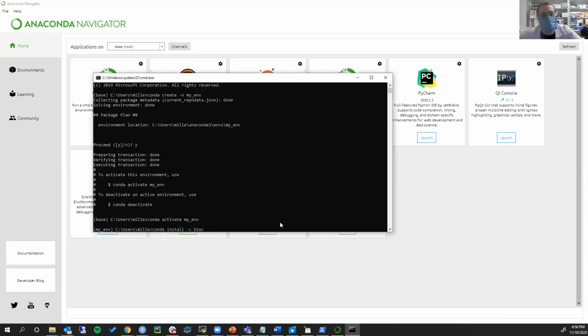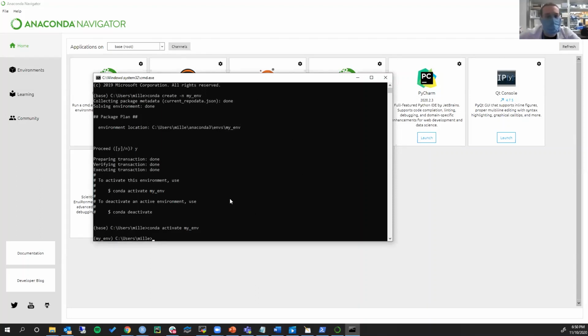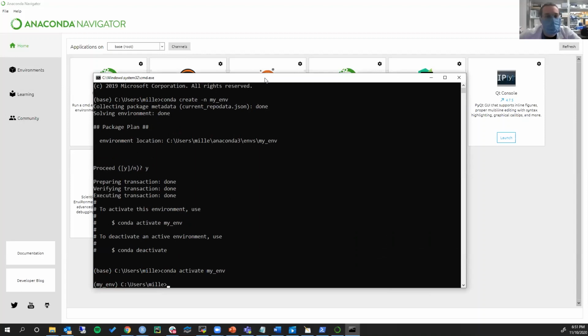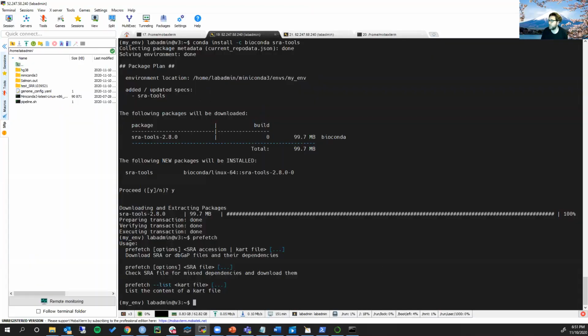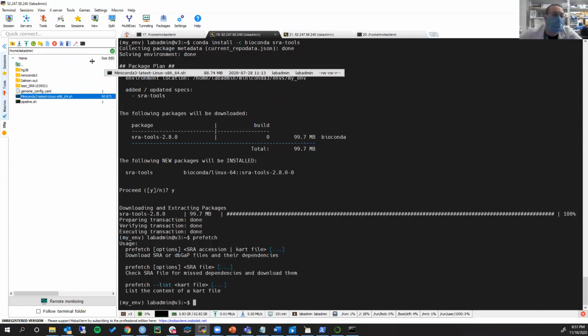So you just used it on your MobaXterm. Did you have to do anything to link your local computer's Anaconda install to your MobaXterm session? How do those communicate? Oh, this isn't on MobaXterm. No, but just now before you went back to Windows. Oh, here? I'm connected to a remote computer that has Conda. Yeah, so you can see here, this is actually the installer.